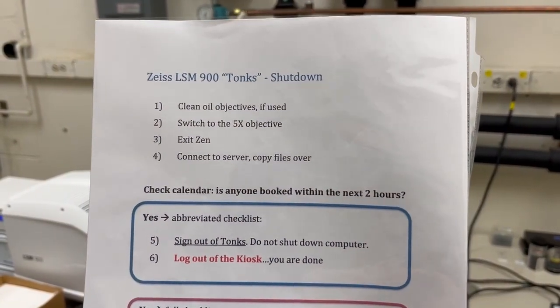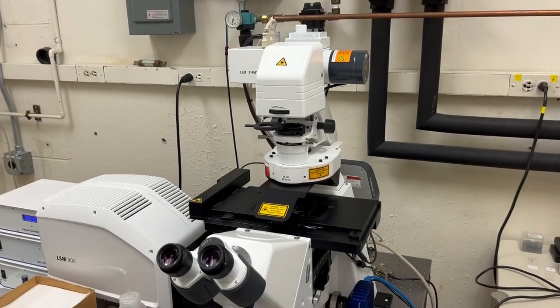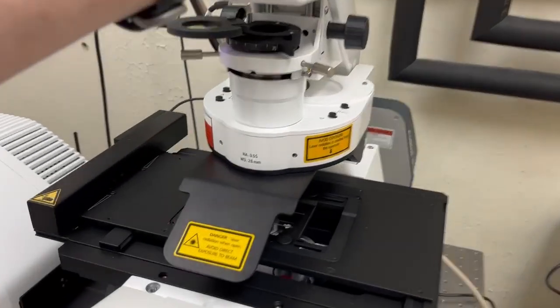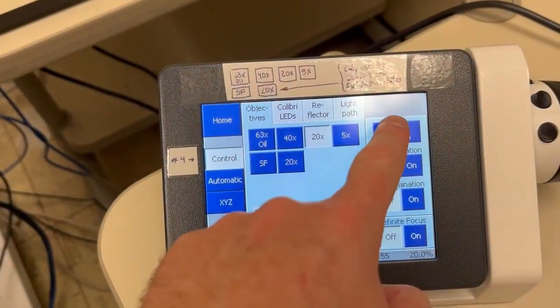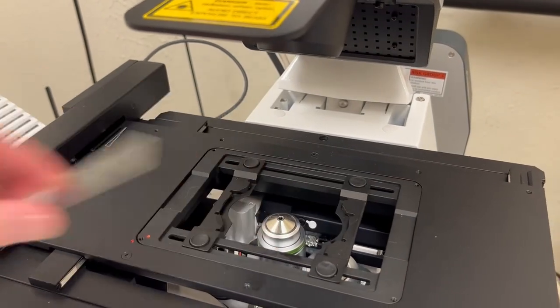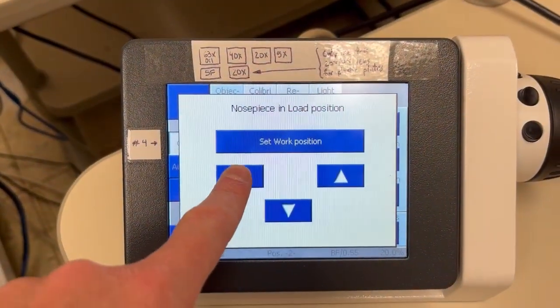The first instruction is to clean oil objectives if they were used. I did not use oil objectives during my session, so I don't need to do that, but I do need to remove my sample. When you remove a sample, you want to go to load position to drop the objective and then remove it. Then you can go back up to the working position.